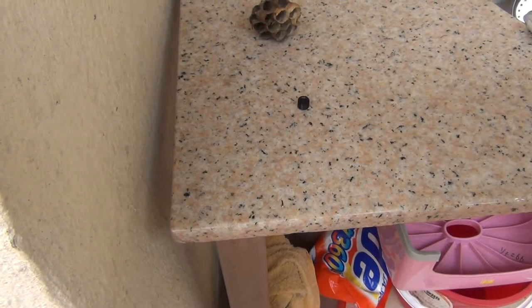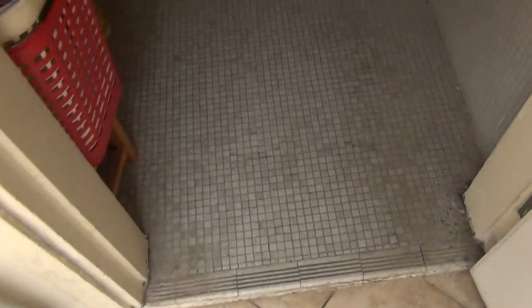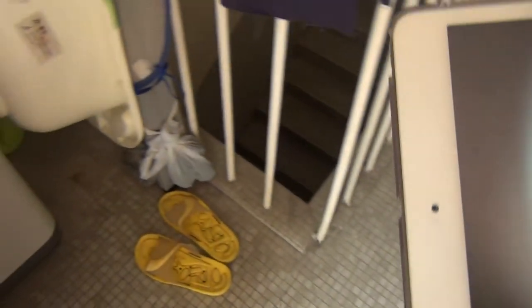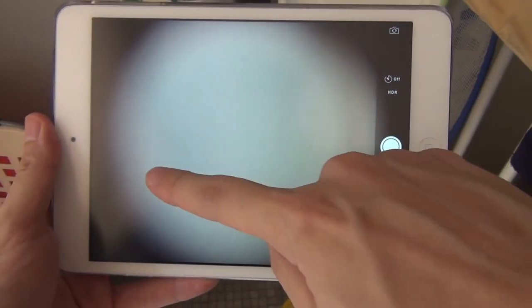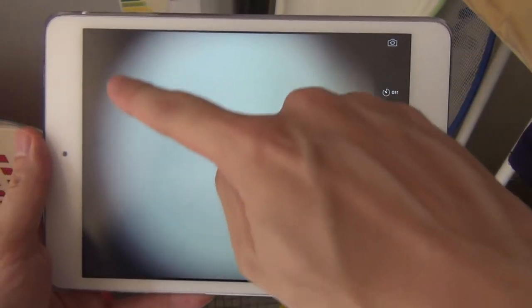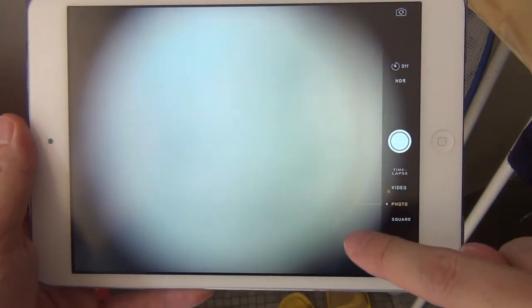Still can't see anything — way too bright outside. Let me get inside the staircase. Okay, there you go, much better. It's too bright outside, that's why. So you see, you get a huge big circle right here and the corners are black. That's because the field of view got narrowed.